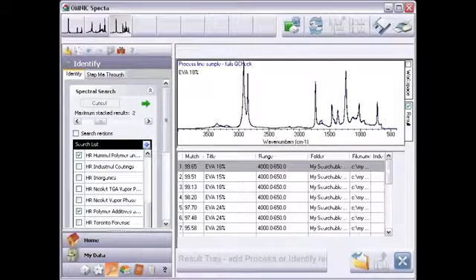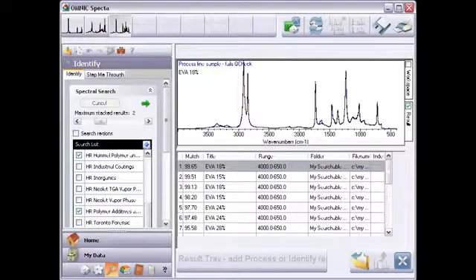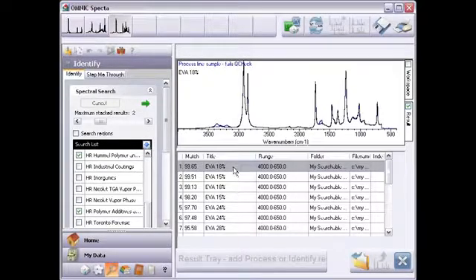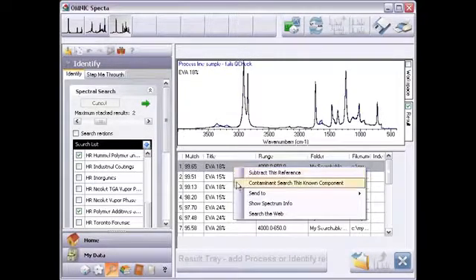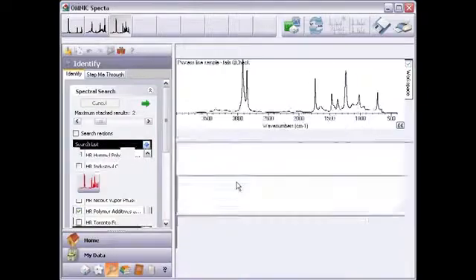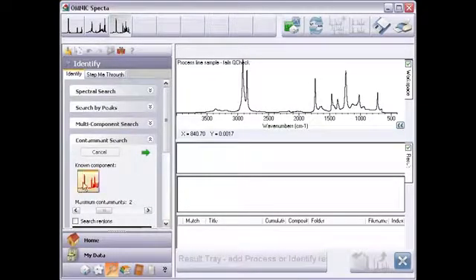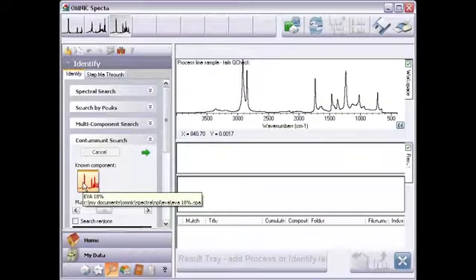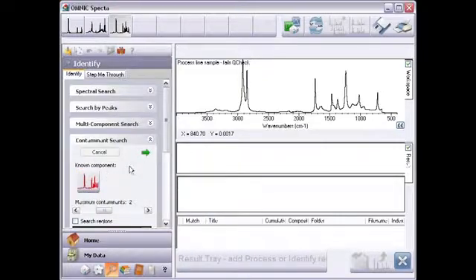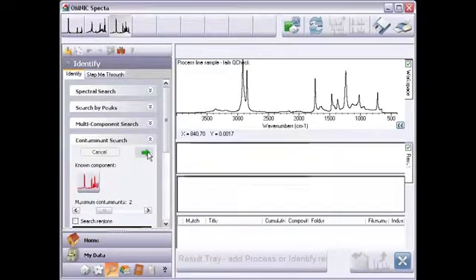Here's where contaminant search makes things easy. I'll right-click the top hit and choose contaminant search this known component. Spectra opens the contaminant search task and sets up my 18% EVA search hit as the known component. Now I'll click here to search for the contaminant.